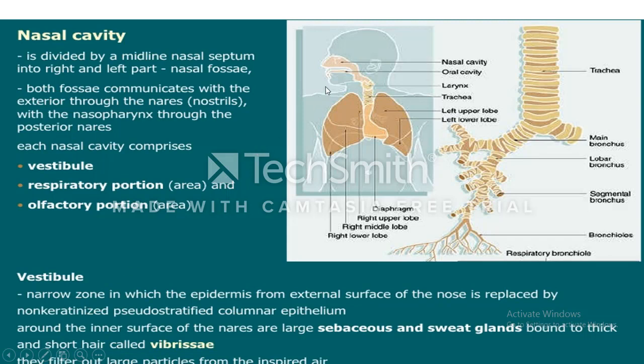This vestibule covered by thin skin consists of epidermis, dermis, and hyaline cartilage. In dermis of thin skin in vestibule, hair short, and sebaceous gland and sweat gland.